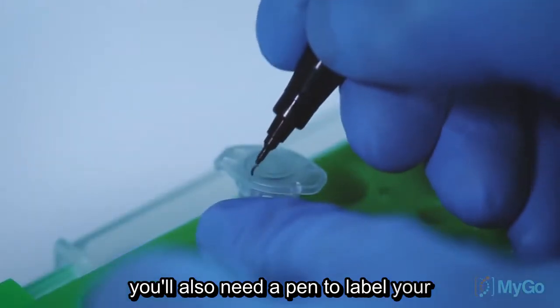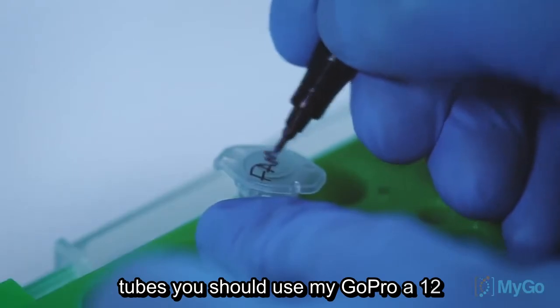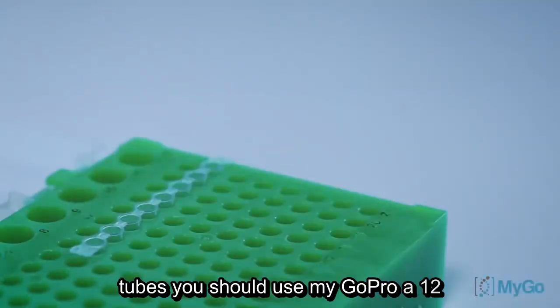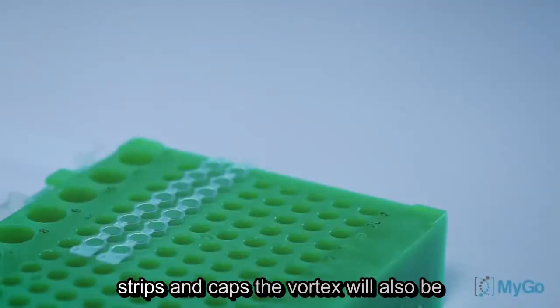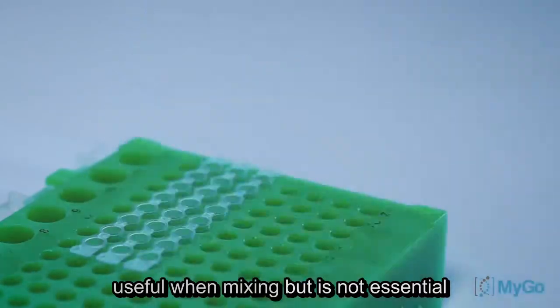You'll also need a pen to label your tubes. You should use MIGO Pro 8-well strips and caps. A vortex will also be useful when mixing, but is not essential.